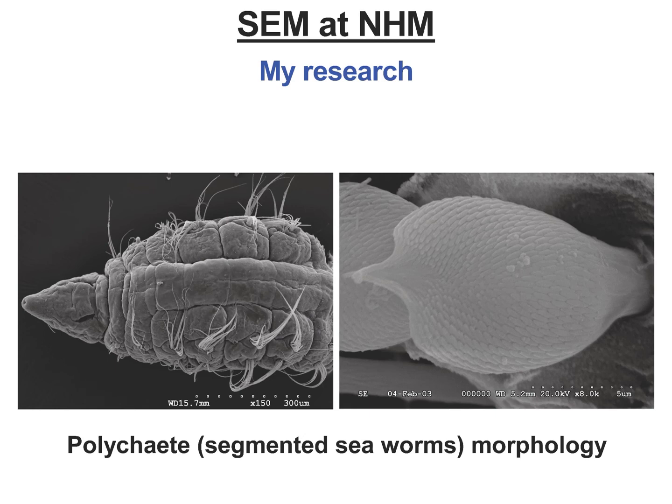Nearly all polychaetes need to be examined using microscopes, and scanning electron microscopy is especially useful when dealing with very small translucent specimens. SEM allows for examining surface details along the body, such as on the photograph on the left, and at higher magnifications, such structures as the bristles that are located along the body, like that shown in the right photo.